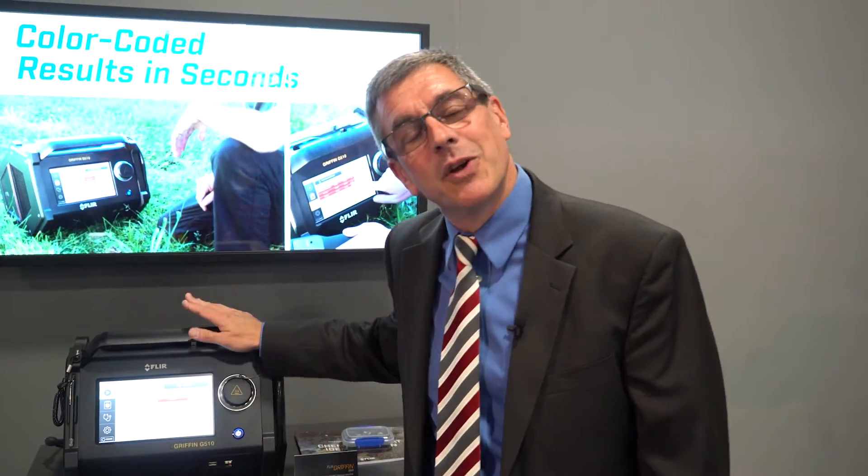Hi, I'm Dave Cullen. I'm here at AUSA, and I'm standing in front of something we're real proud of, the Griffin 510.